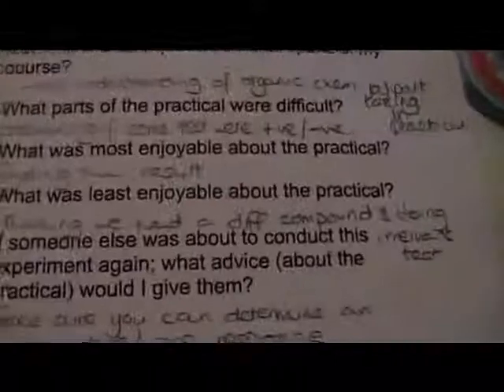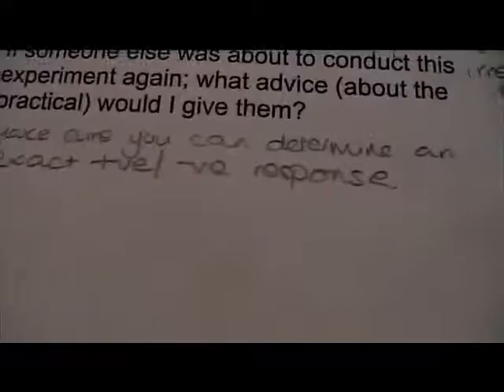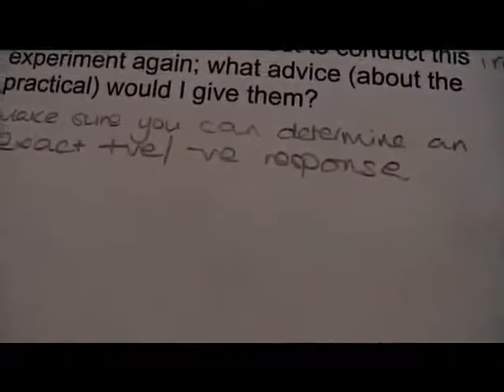The most enjoyable part was finding the result and getting it finished. The least enjoyable part was thinking that we actually had a different compound and carrying out loads of tests that we didn't actually need to do. And if someone else was to carry it out, I would tell them to make sure that they were sure of the results before carrying out a load more tests.